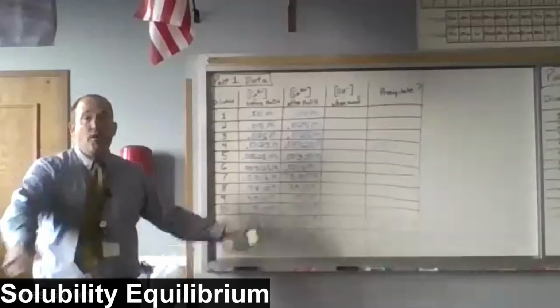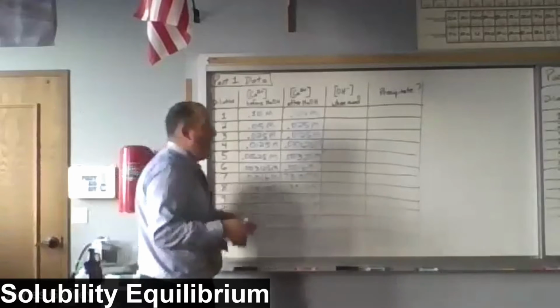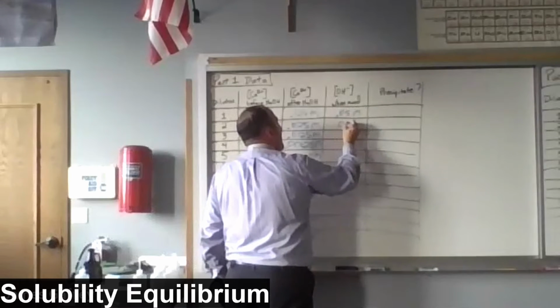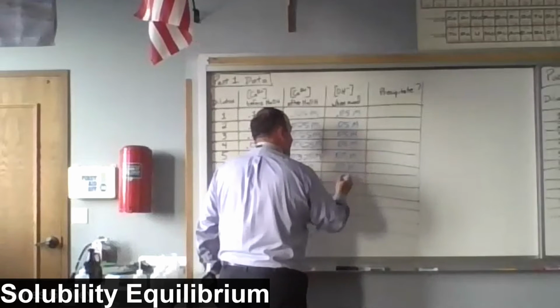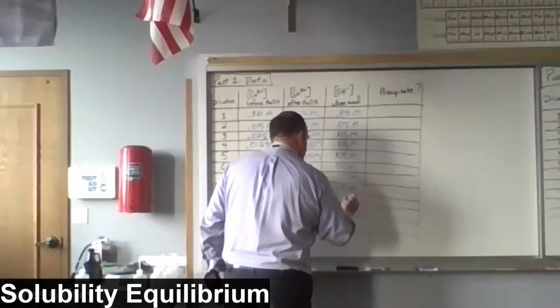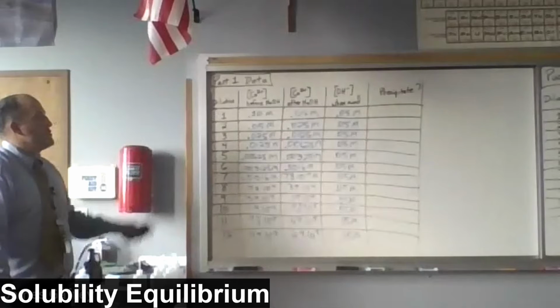Well, if you had 5 drops of some dilution of calcium, and you're adding 5 drops of 0.1 molar hydroxide ion, after mixing, the concentration of hydroxide for every single well is 0.05 molar. So we've got our numbers worked out.